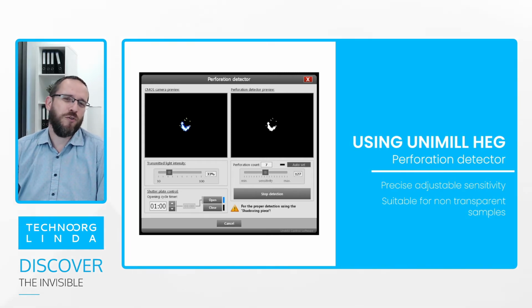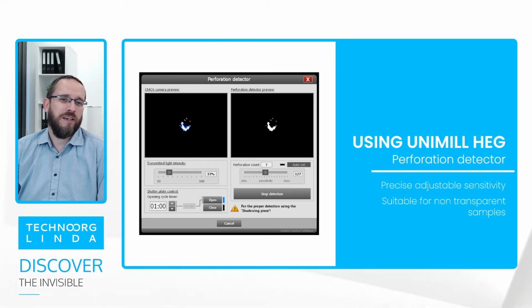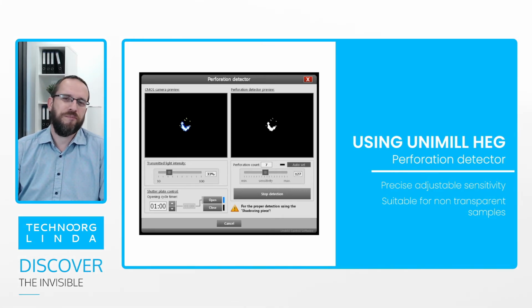So if you already have a larger hole but you are expecting more small holes to develop, you can set the number of holes you expect. You can also stop the thinning before the sample is perforated if the sample, like silicon, gets a bit transparent while it gets thinner. So it is a very advanced and a very useful feature of the ion mill.